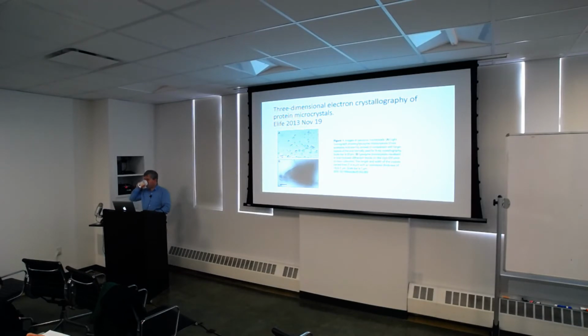Do you expect the diffraction to be exactly the same if you go to the X-ray beam, if you go to the synchrotron, or if you do MicroED? Well, I think you'd see, it's a different wavelength, so the sphere is different, but the spacing and the units will all be the same. But how far out it will diffract to? That can go further.